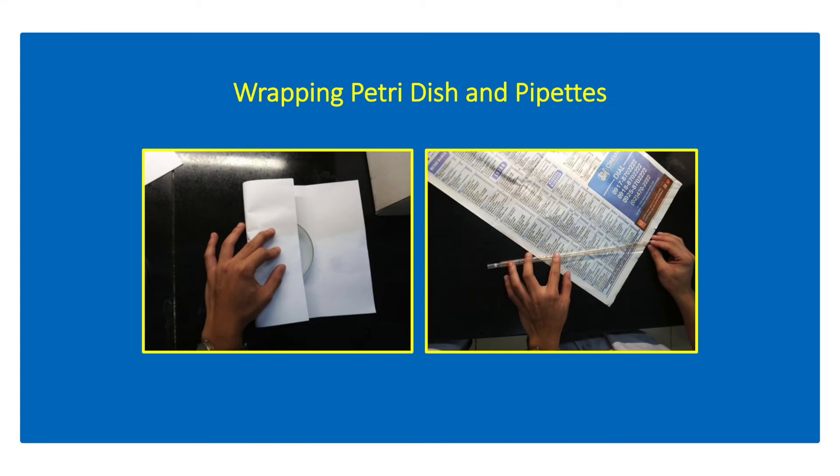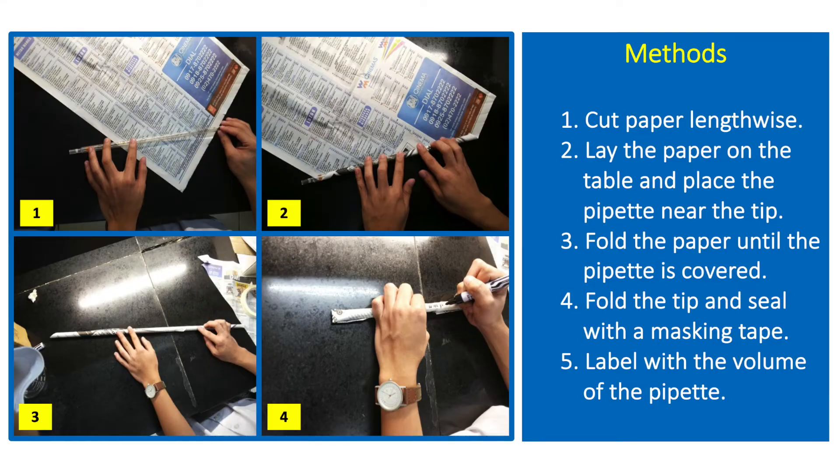Wrapping is a technique done to prevent contamination of the petriplates and pipettes after they have been autoclaved. In wrapping pipettes, cut a piece of paper lengthwise, lay the paper on the table, and place the pipette near the tip.